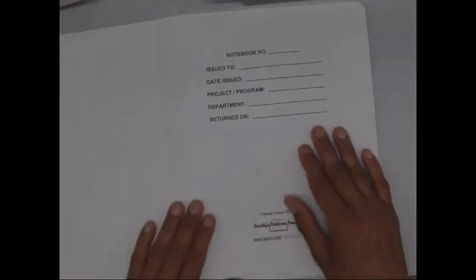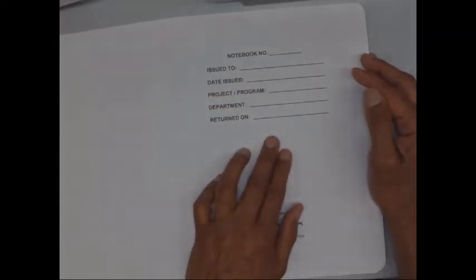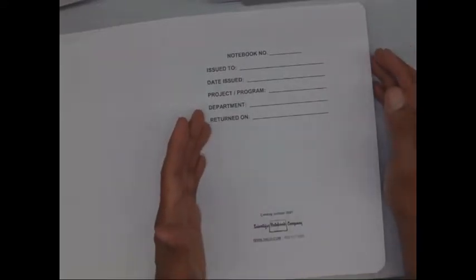In every lab notebook, there is a notebook number. Now, if it is the first notebook you're ever receiving from the academies, you will write 1 there. Issued to is your name, and it should be your full name, and not any shortened form, but the official name.